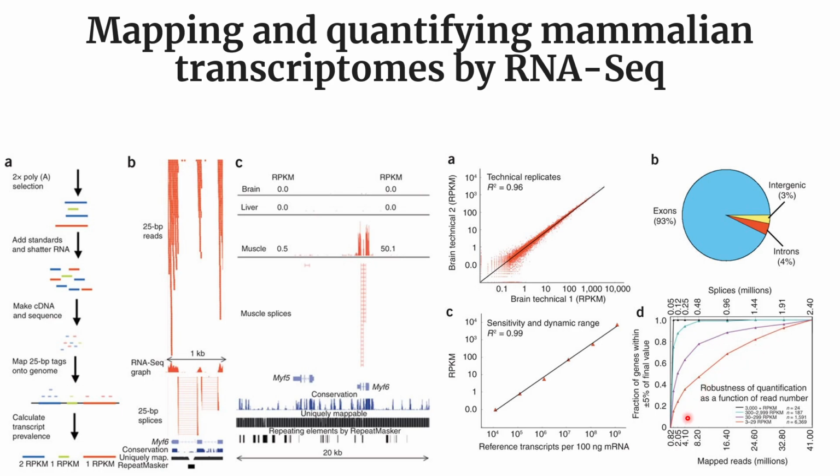So we can see that most of their data lies in this range, whereas some of the data lies in the extreme range. The 187 data lie in this range. So this indicates that compared to the 6369, the number of data that shows non-reproducibility is very low.